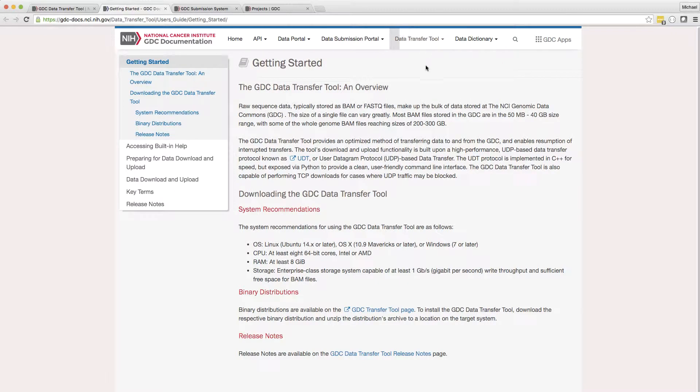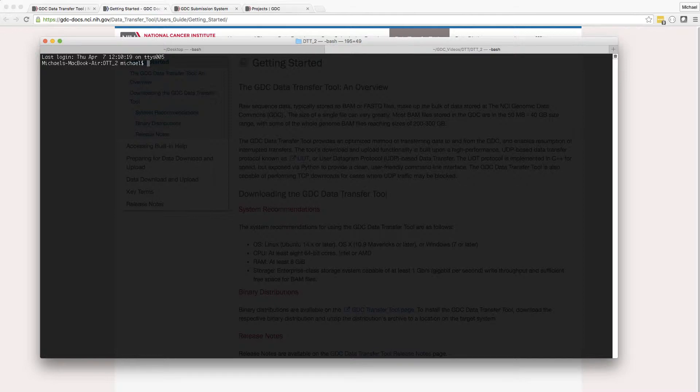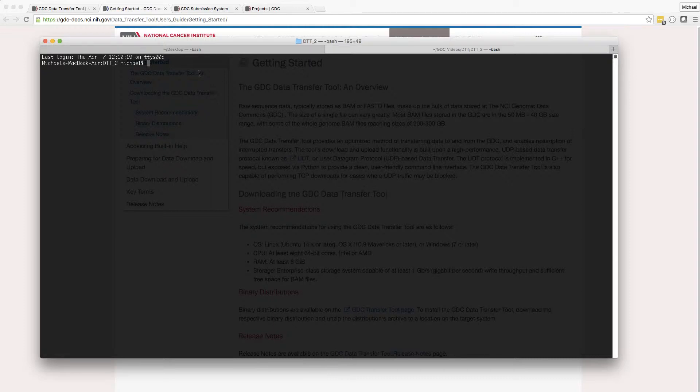Once installed, help menus are available for both the upload and download functions within the tool. For example, if I wanted to see the help menu for the upload function, I would type GDCClientUpload with the '-h' option.